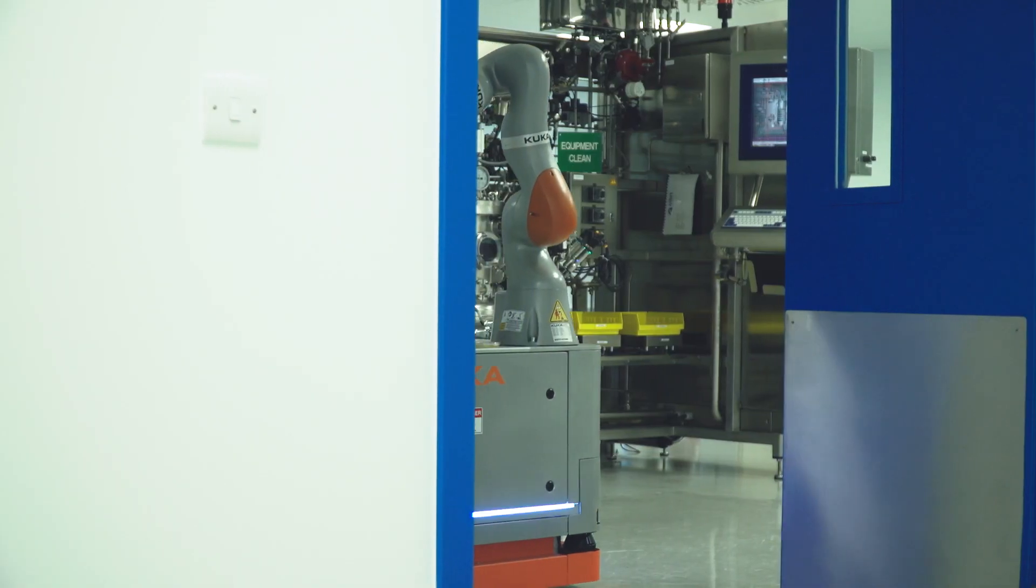Project Marvin is an exciting autonomous robotics project bringing together both academia and industry.